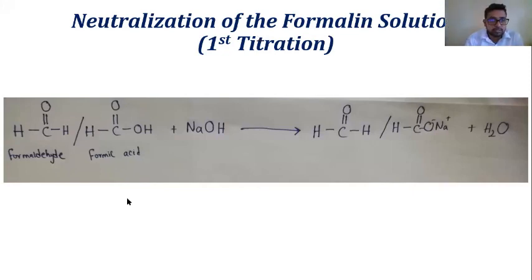So this is the first titration in this experiment. We neutralize formaldehyde using sodium hydroxide. So you know that this is formaldehyde, and what is the specialty of formaldehyde? What do you know about formaldehyde, or formalin, what we call? What is the systematic name of formaldehyde? Is it aldehyde or ketone?